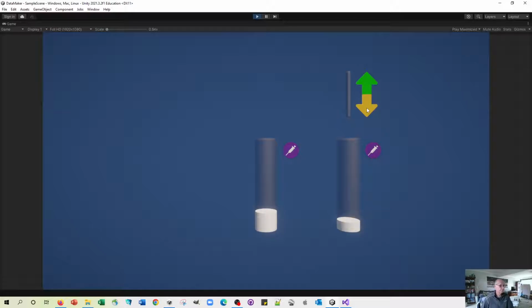So the key features of this are this guide, sending the pipette tip to the place that it needs to go, and then the formation of this droplet, and then some way of detecting that droplet so that we can increase the volume in the tube.